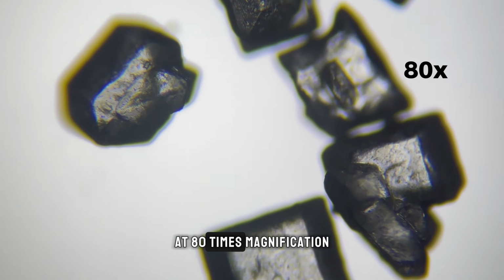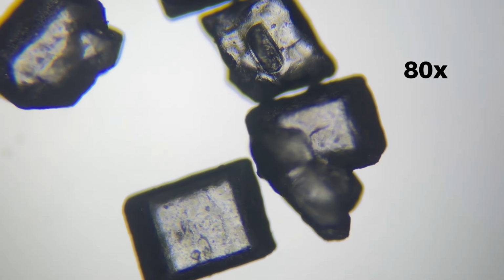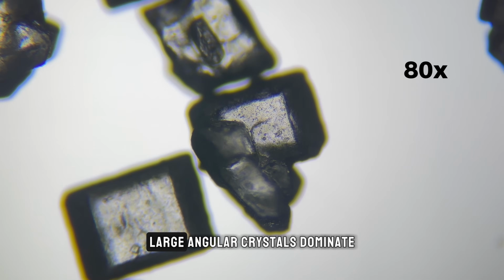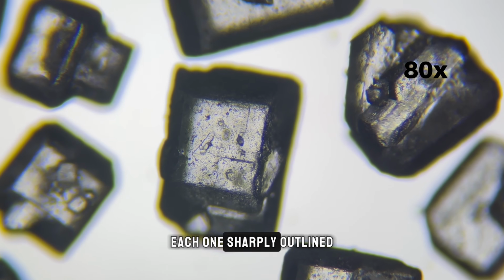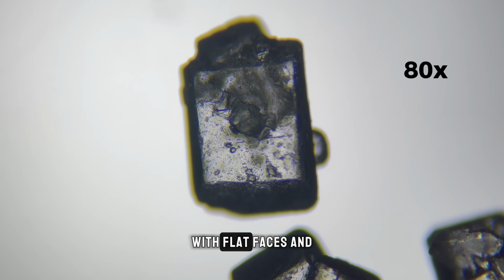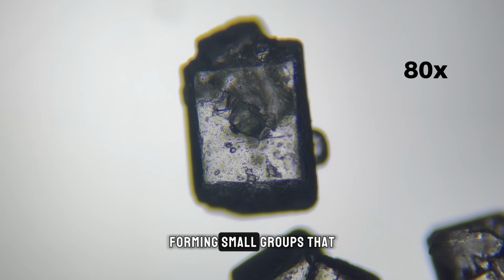At 80 times magnification, the sugar sample still looks deceptively simple at first glance, but it quickly starts to lose its familiar kitchen identity. Large angular crystals dominate the field of view, each one sharply outlined against the bright background. Their shapes feel geometric and intentional, with flat faces and straight edges that reflect light unevenly. Some crystals sit isolated, while others cluster together, forming small groups that touch at sharp corners.